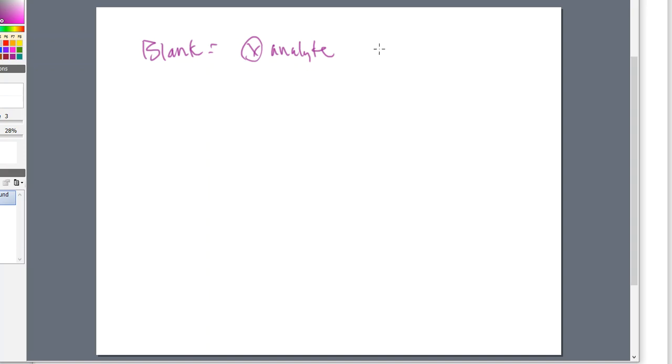So in our previous examples with the cereal, this is going to be a solution that really doesn't have iron in the mix. This is something that is typically the solvent, and it's just the solvent only. Okay, so we've talked about this term matrix, and now we're talking about this term called a blank. And I said, well, the matrix could just be the solvent. And now I'm saying, well, the blank is just really the solvent. And it's like, well, what's the difference between the two?